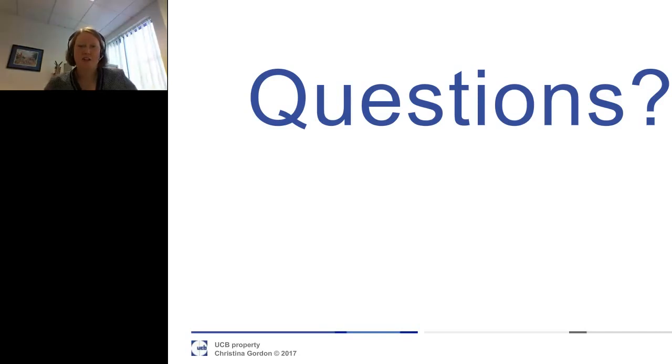Yeah, thank you very much. That's a great question. We have decided that we wanted to keep this automation platform as simple as possible. So we wanted to just focus on the capacity rather than focus on how many different things it can do, how many different scales, and so on. So if we keep it simple and say it can do consistently 30 mils all the time, and if we ever had a demand, for example, of expressing 200 mils, then we would just do several times 30 mils. So we wanted it to be as high throughput as possible, but fairly simple. So hopefully that will work.